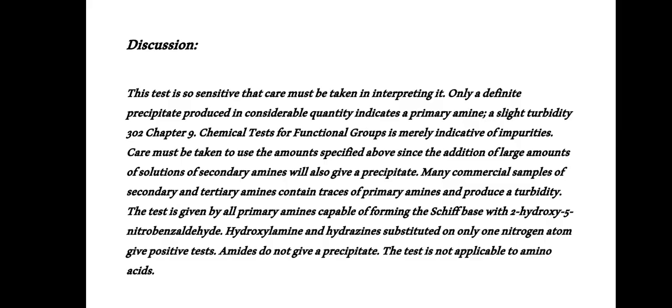This test is given by all primary amines capable of forming the Schiff base with our reagent, 2-hydroxy-5-nitrobenzaldehyde. Hydroxylamine and hydrazine substituted on only one nitrogen atom, which is a primary amine, would give a positive test. Amides do not give a precipitate, and this test is not applicable to any kind of amino acids.